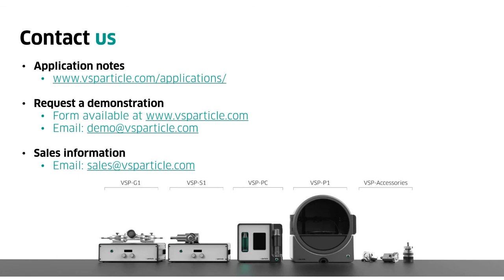Thank you, Tobias. I think we will be moving on to the last question of today's session as our time is getting up. Martin Irvin asks, do you have issues with particle concentrations being too high for CPC single count mode, or does using a DMA negate this? When using all those different flow rates to control diameter, are there issues with concentration high and low?